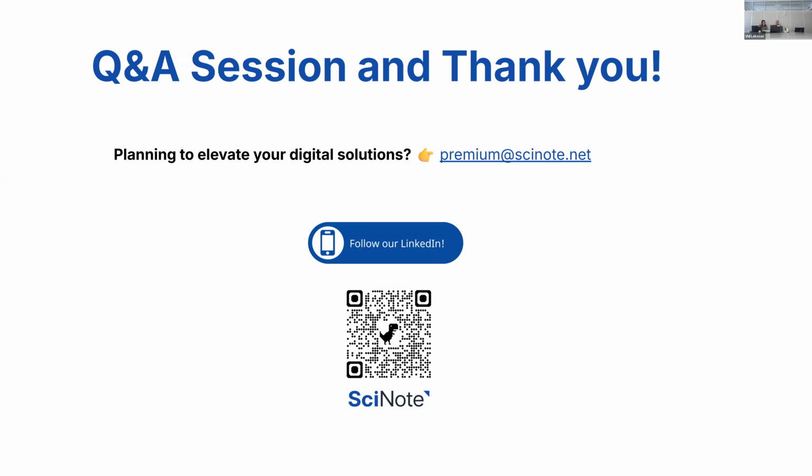So we have a question about AI implementation. This is not so connected to inventories, but we are tackling it slower because we want to be smart about it. We see a lot of AI tools out there that are just, I'm going to call them gimmicks, but they don't really offer any real-life value.